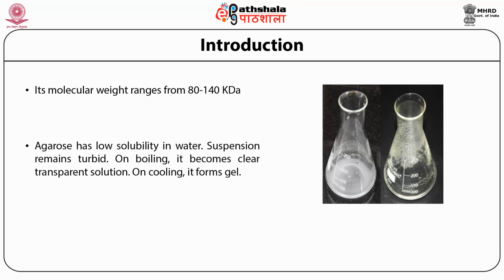Agarose solubility in water is low. However, when an aqueous suspension of agarose is boiled, it results in a clear solution. When the boiled and clear solution of agarose is slowly allowed to cool, it forms a gel.